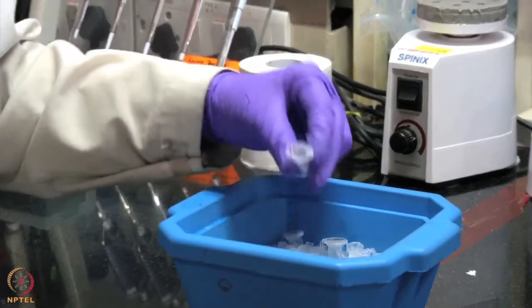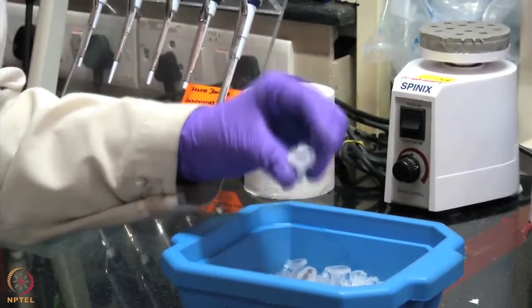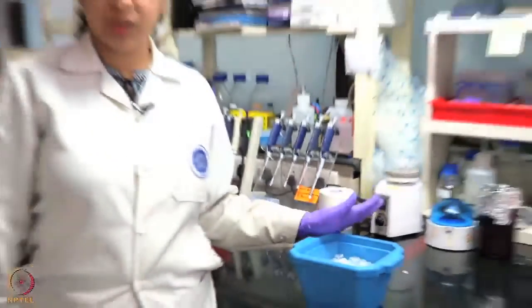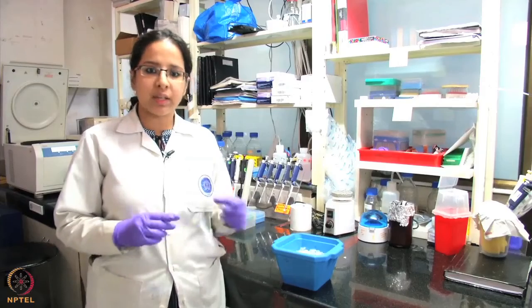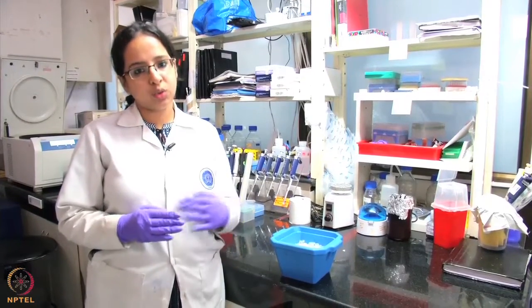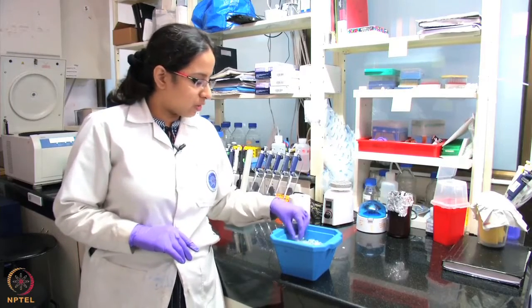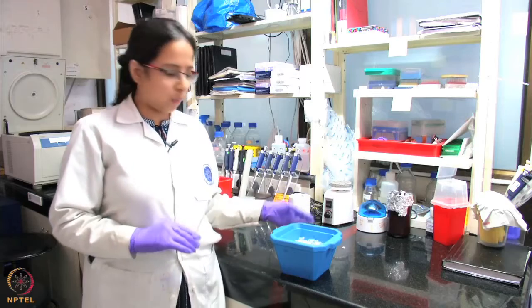We have taken our vector DNA, and also our insert DNA. We are going to treat them with restriction enzymes. Restriction enzymes are going to cut this DNA and create compatible ends, so that the insert and the vector can join and form a perfectly circular structure. So we are going to carry out restriction digestion separately for insert and vector.